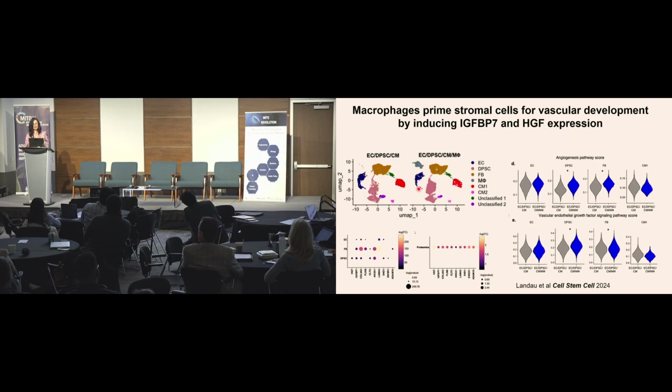Now, if you look at this result here, you can see it looks like there are a lot more cell types than we put in, right? We put in, I'm telling you 4 cell types, but you can see a lot more going on here. So there are less mature and more mature cardiomyocytes. And then we also have macrophages here. We have stromal cells that we put in, but we also have fibroblasts, like cardiac fibroblasts.